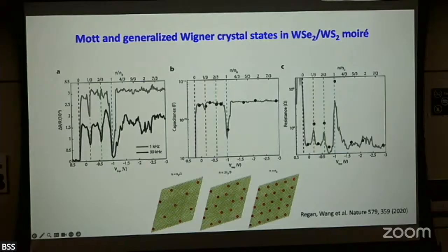So what we did, we developed this sensing technique. Instead of measuring the sample itself, we introduce a sensor. Let me just explain this technique to you. And this technique actually can work with material that is also sensitive to the displacement field.